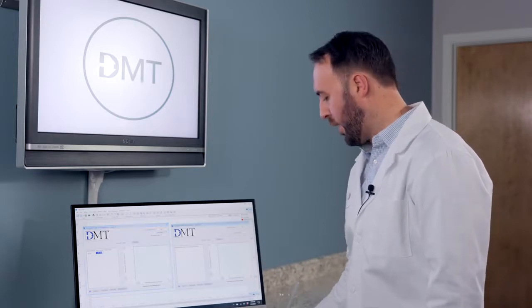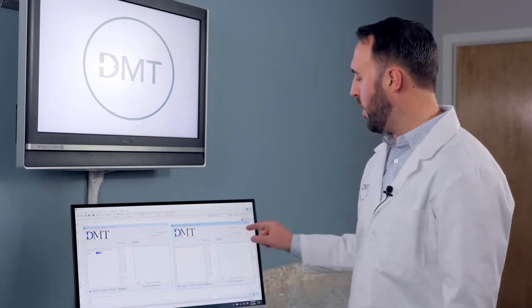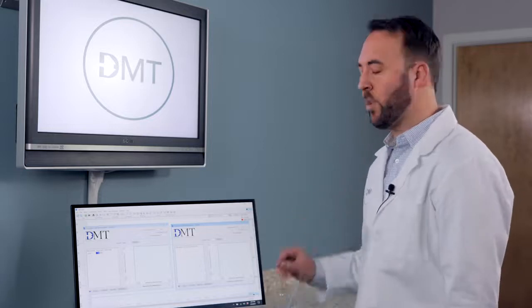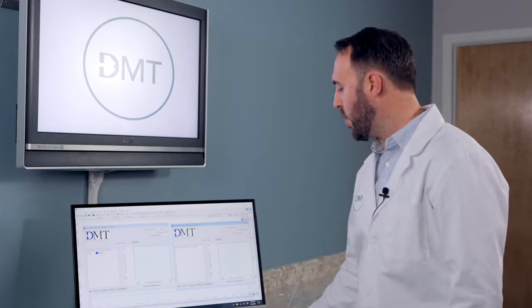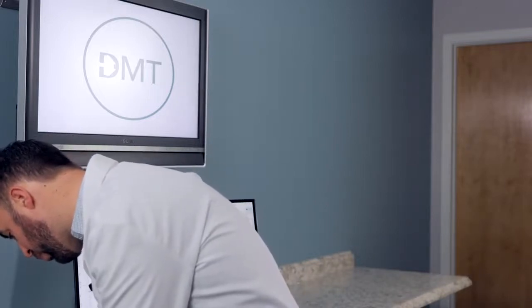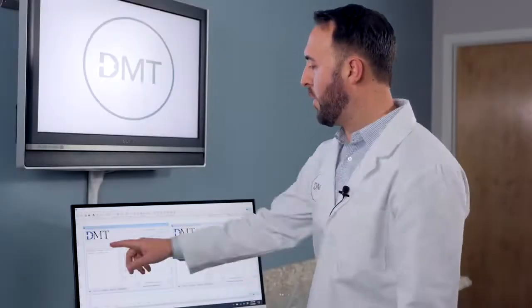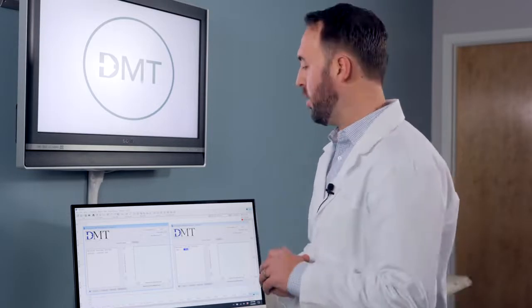Channel 2, again, spans the entire gap of the jaw. So we will do 0 and 2 as our endpoints, which will tell us that our tissue length is 2 millimeters. Again, we are using 40 micron wire, so we will enter that. And now we will take a reading from channel 2's micrometer. So now we have our first point on channel 1. So now we can add our stretch and go on with the normalization.